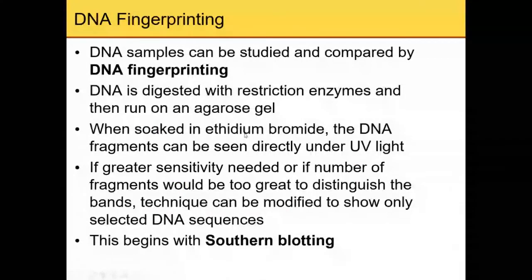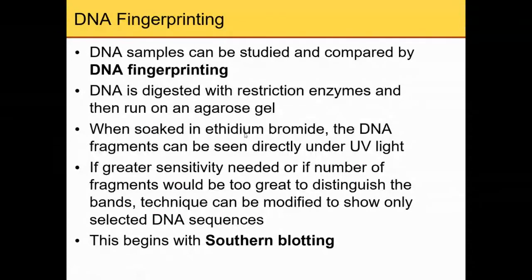And the DNA fingerprinting. Basically, in DNA fingerprinting, you digest the DNA with a restriction enzyme, and then perform gel electrophoresis.